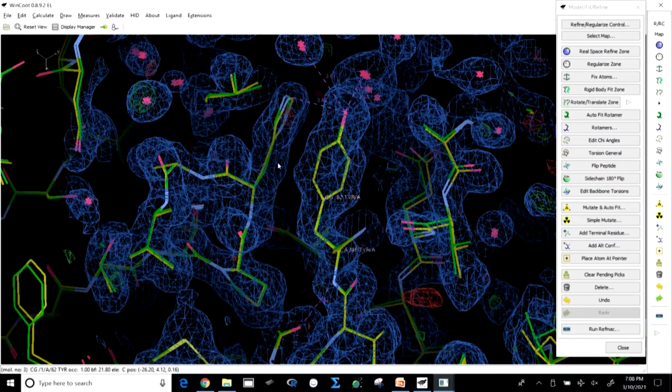Now, we will see the thing which is called mutation. You all who are working or following this course know that mutation has a very big role. What is mutation? Mutation is the change of the amino acids. So, when you are doing structure understanding, mutation plays a huge role, and here you could do mutations very easily.